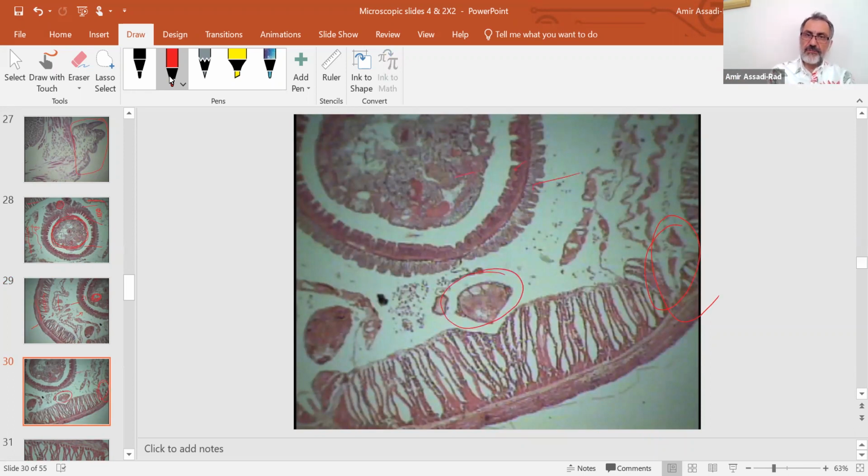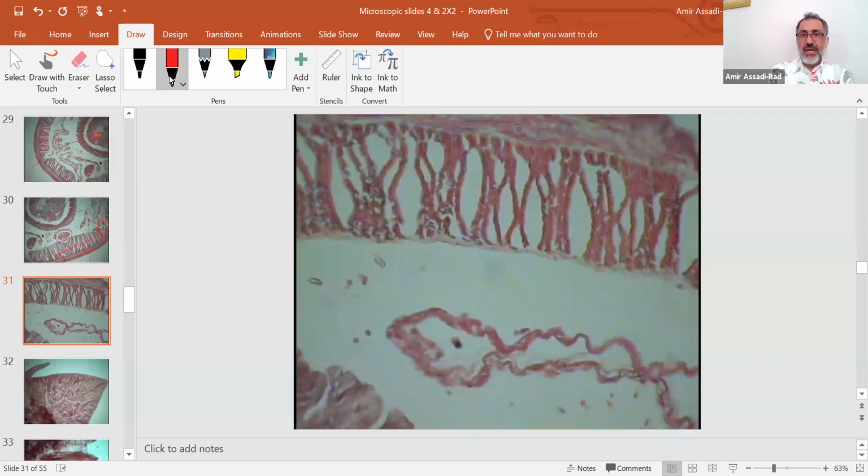We talked about all of these before. Longitudinal muscles, circular muscles, these are cuticle and epidermis right here. Okay, this is peritoneum right here, longitudinal muscles, circular muscles, and of course, this is coelom, this is kidney, and the most significant thing in this slide is the peritoneum.